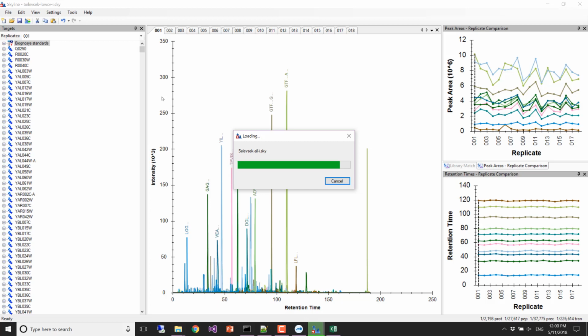Anybody remember how many transitions the big one has? I think it's over 600,000. So, you know, maybe as much as 3 times as many as the low CV one.